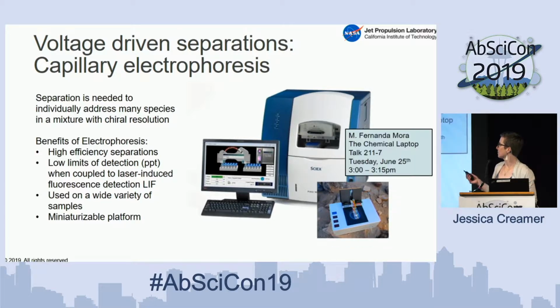So this is the big system. The commercial system is about the size of a dishwasher, and this is one of our portable systems, the chemical laptop, that is about the size of a shoebox. So if you're interested in learning about how we're shrinking that technology and making it more portable, go to Fernanda's talk tomorrow.